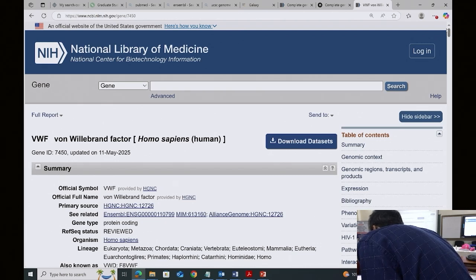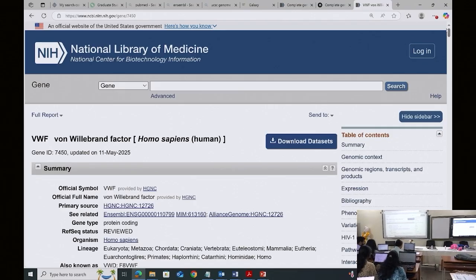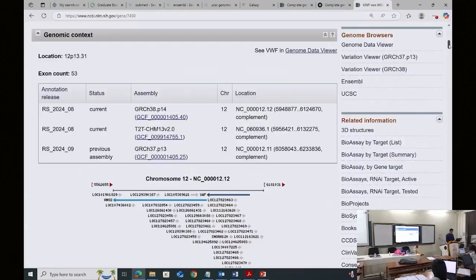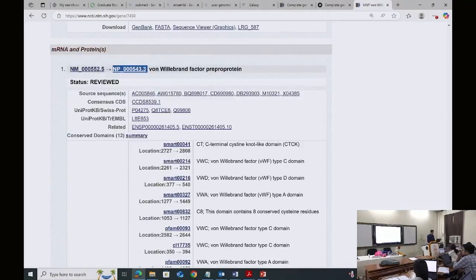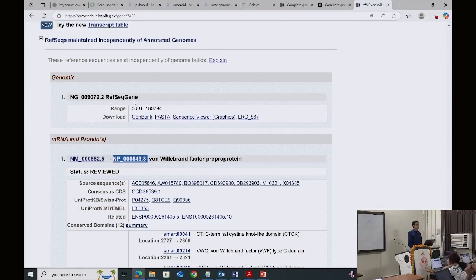Next. Yes. So you have these accessions. You can click for GenBank for this also. There you can see CDS. And now look for CDS. Yeah, look for CDS. This. Okay. So you have to get the CDS coding sequence for this. So here it is. These are the accessions. This is for the gene, and CDS is within the gene.